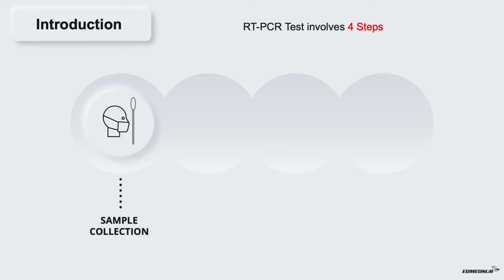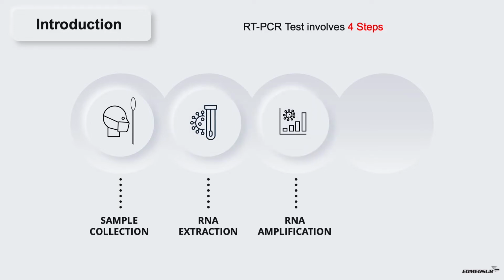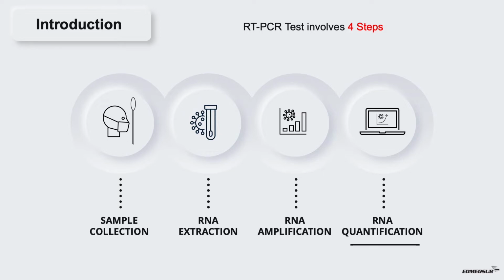Introduction. RT-PCR test involves 4 steps: sample collection, RNA extraction, RNA amplification, and RNA quantification. In the previous video, we discussed RNA amplification. In this video, we will be reviewing the process of RNA quantification.